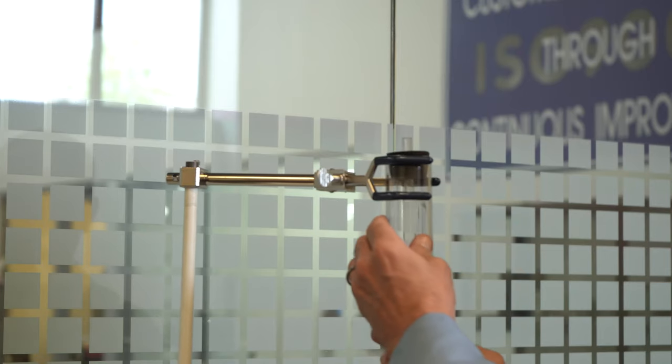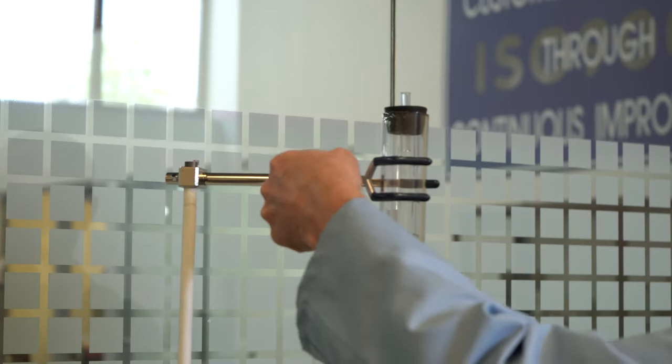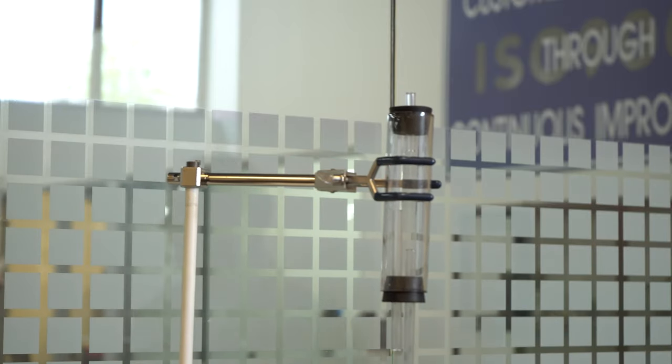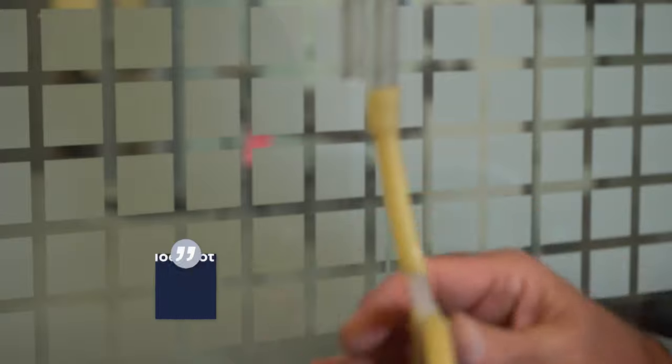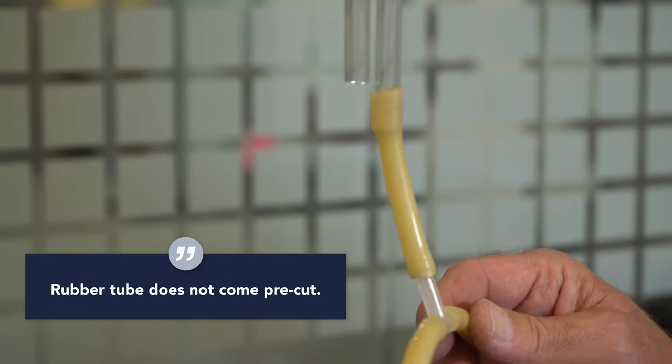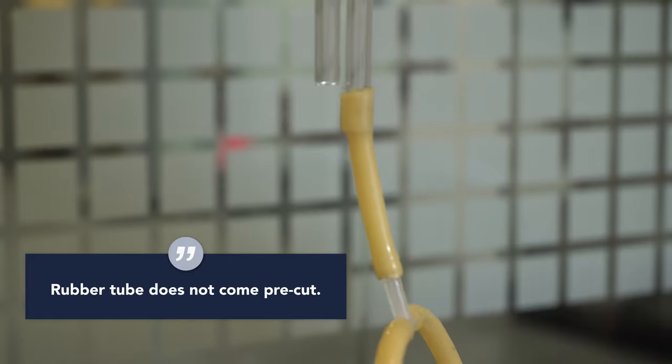Step 5. Insert the flow meter assembly into the three prong clamp and tighten so that it is secure. The single tube should be facing the top for airflow. Step 6. Use the three inch piece of rubber tube and attach it to the lower outlet in the flow meter assembly.